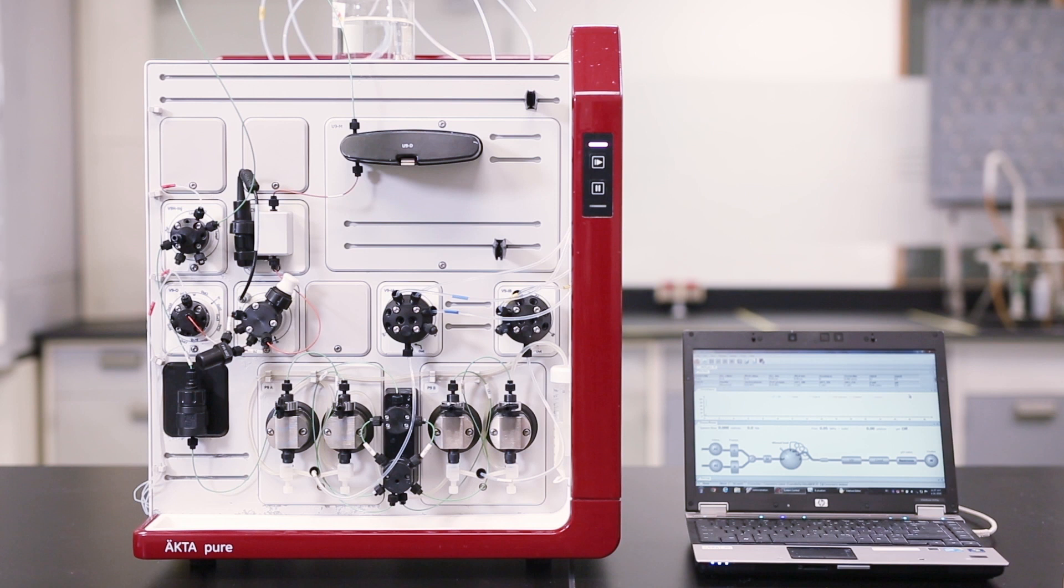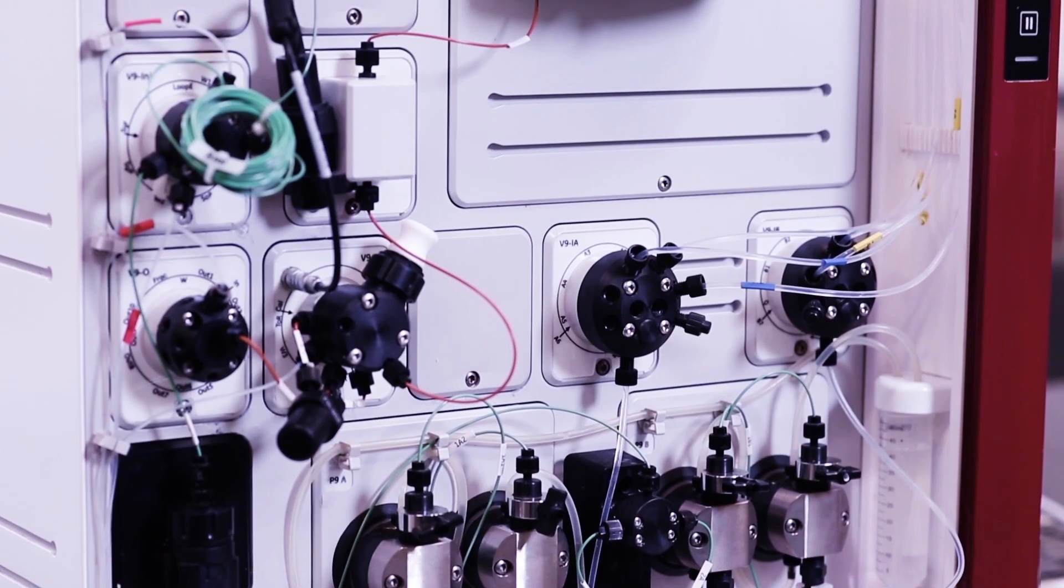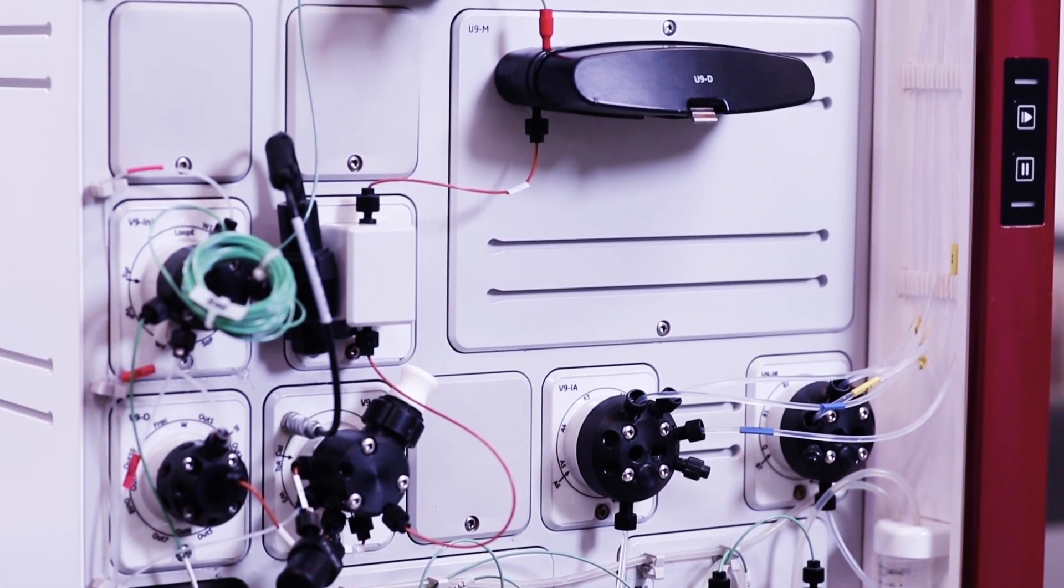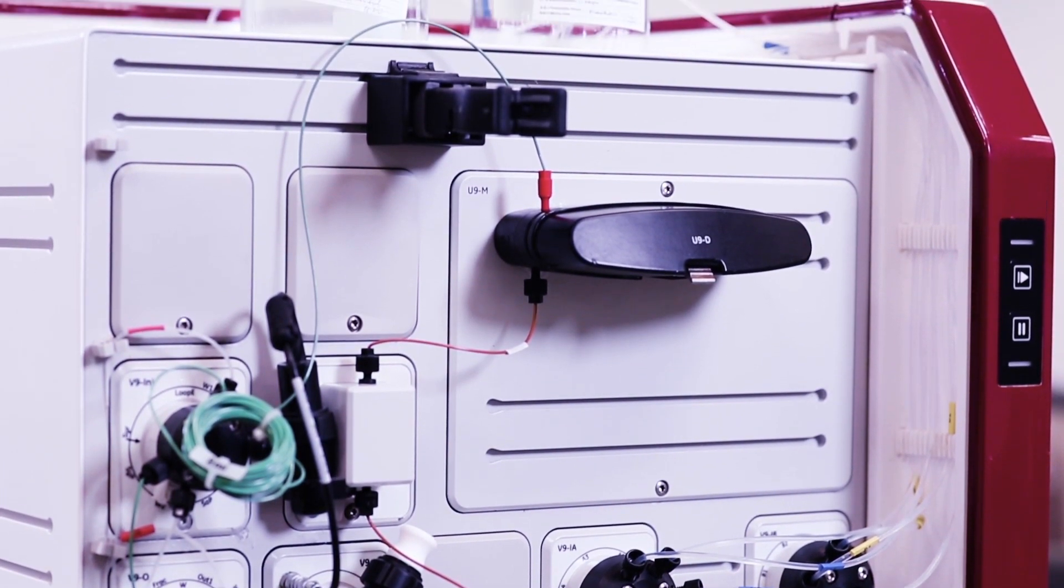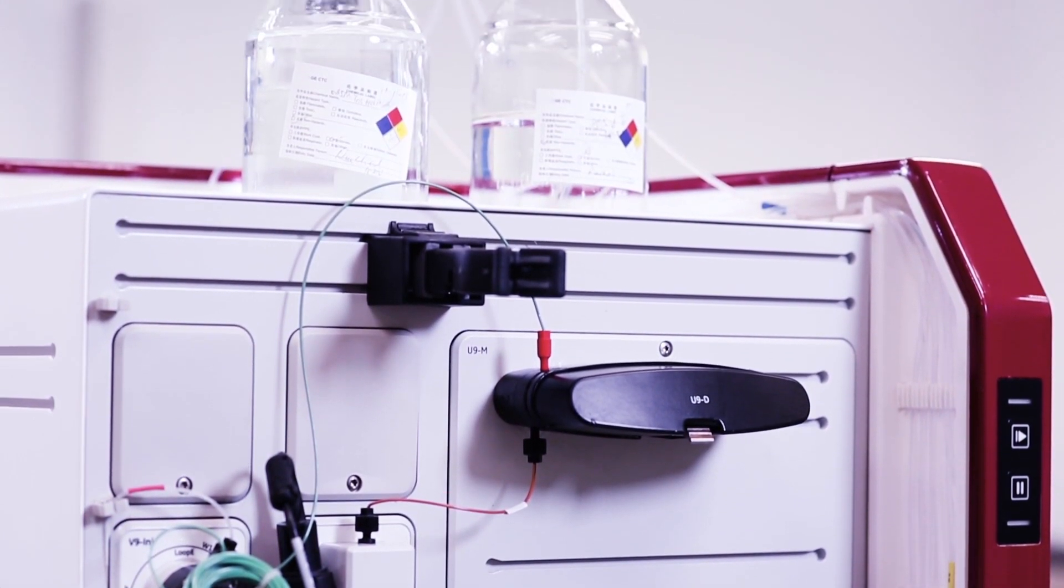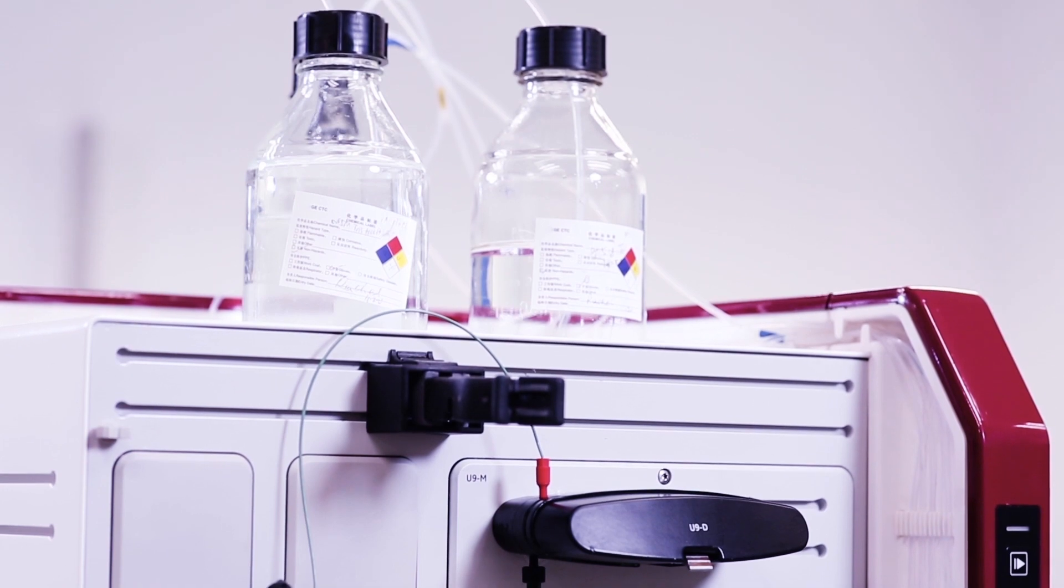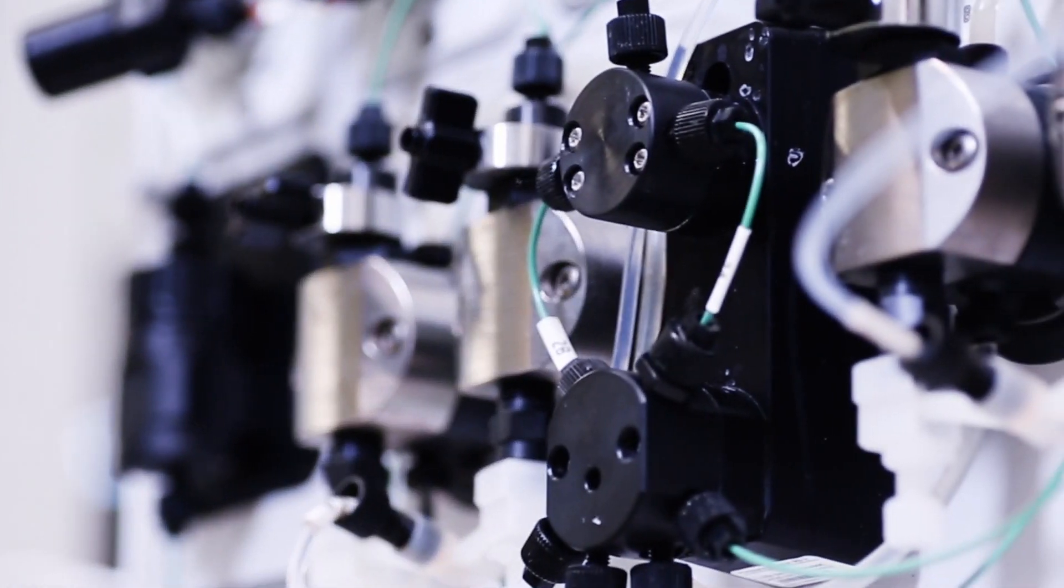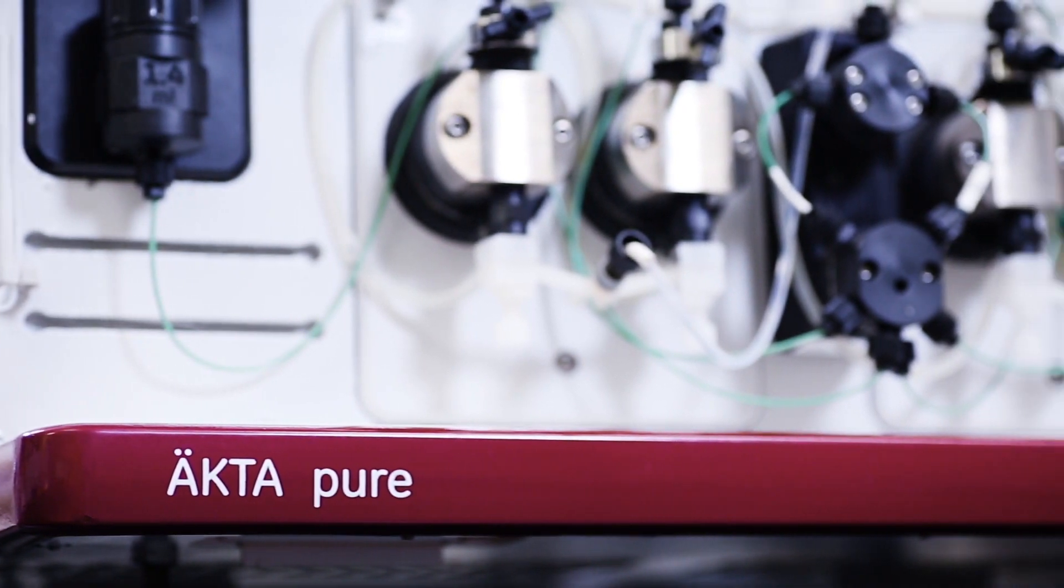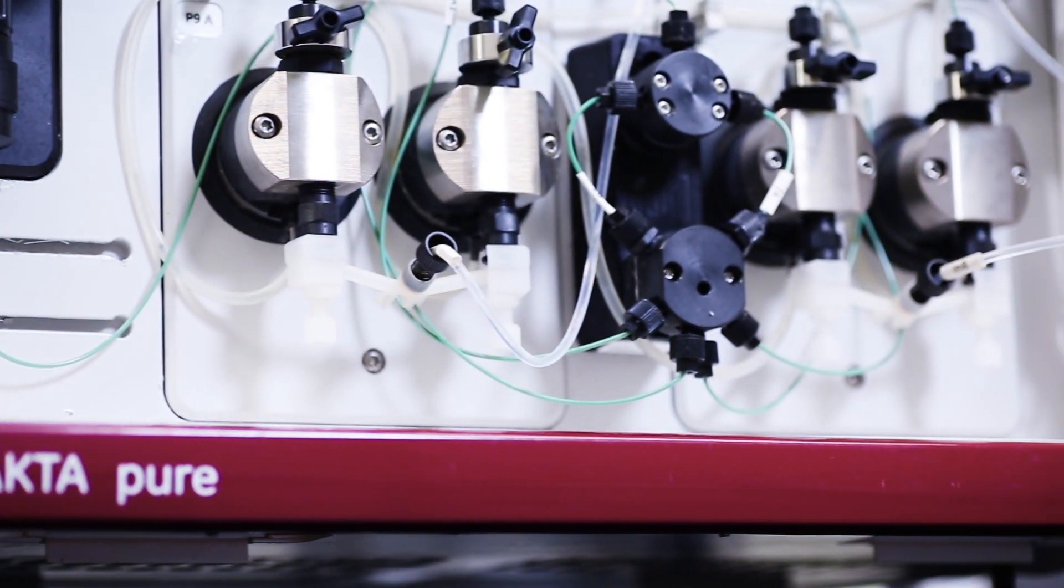Column packing is preferably performed on a chromatography system such as ÄKTA pure. ÄKTA pure is capable of delivering the pressure and flow required to create a well-packed column. In addition, the integrated UV and conductivity monitors along with the Unicorn Control software will help you evaluate the quality of the column packing.